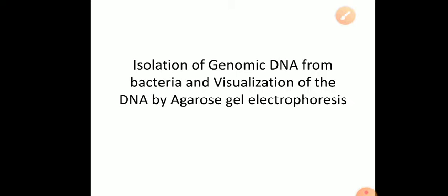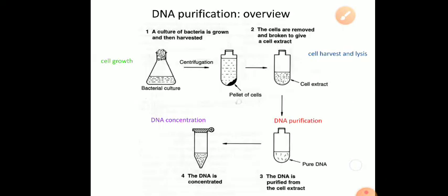Right. In the last experiment, I told you about agarose gel electrophoresis, how DNA can be separated, isolated and visualized by performing agarose gel electrophoresis. Now, the next experiment, that is isolation of genomic DNA. Experimental part we will study next time. Today, I will tell you the basic steps that are involved in isolation of genomic DNA from bacteria.